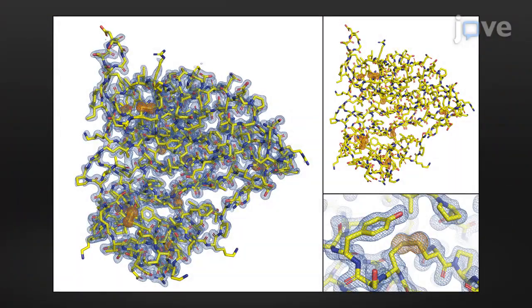Long wavelength macromolecular crystallography exploits the anomalous signal from light atoms natively present in proteins and nucleic acids. This technique is used to experimentally solve the crystallographic phase problem and to determine the identity and location of these elements.